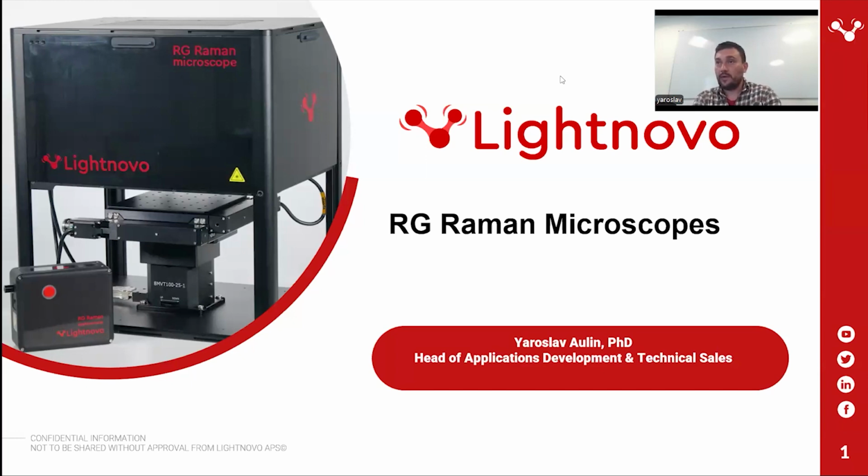And by doing so, you are completely sure that you are protected from laser radiation. Although when you use the microscope objectives, then the beam is really divergent, the working distance is very small, the beam is very divergent. So, and then this is a class 3B laser.